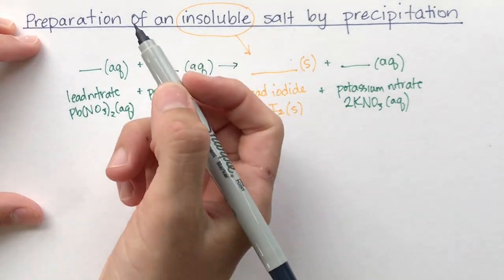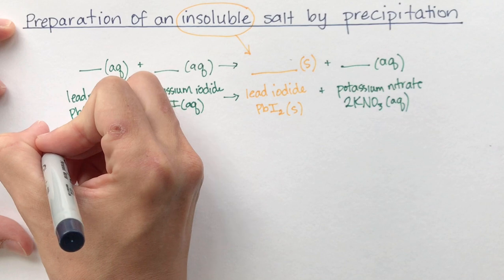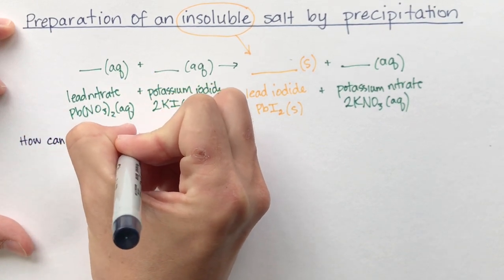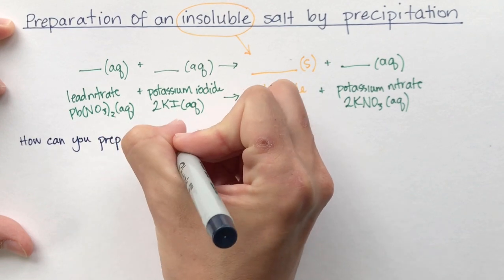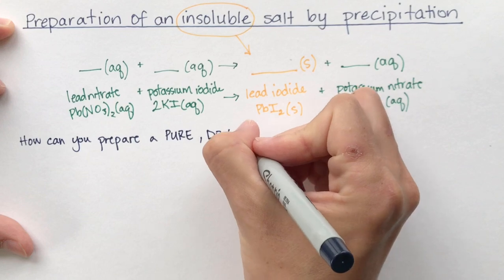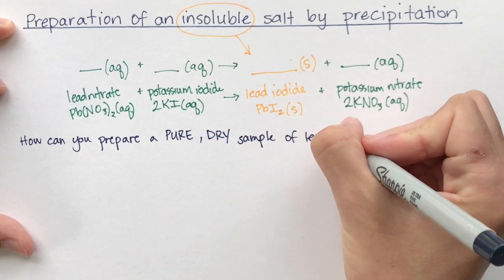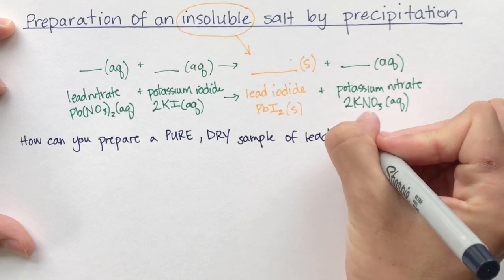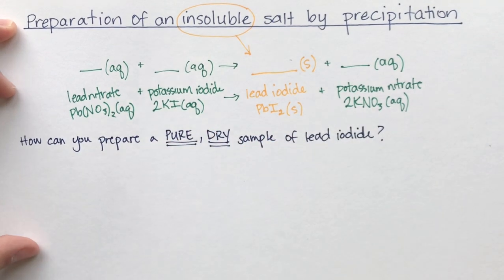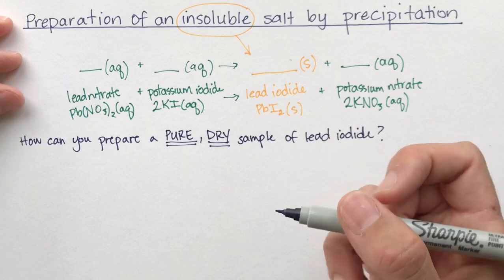They usually ask you, how do you prepare a pure, dry sample of your salt? Okay. Keywords being pure and dry. So it's not going to be quite as easy as just mixing these 2 together, although that is step 1.